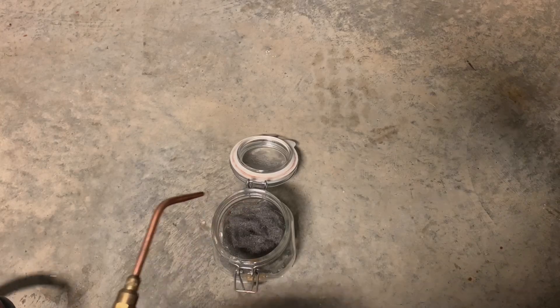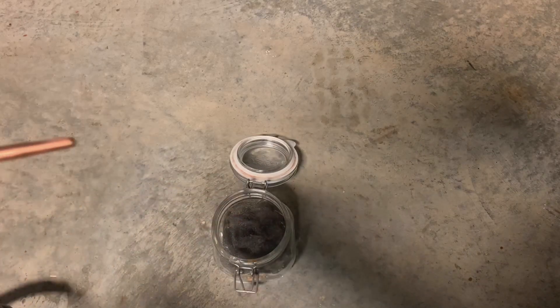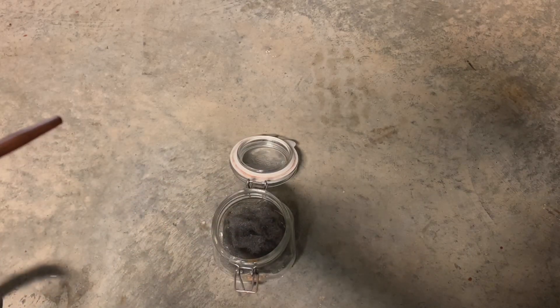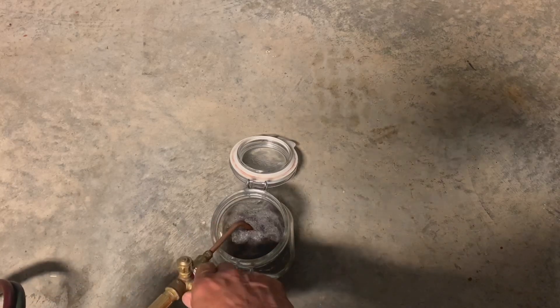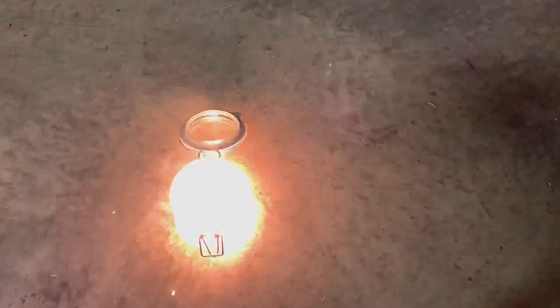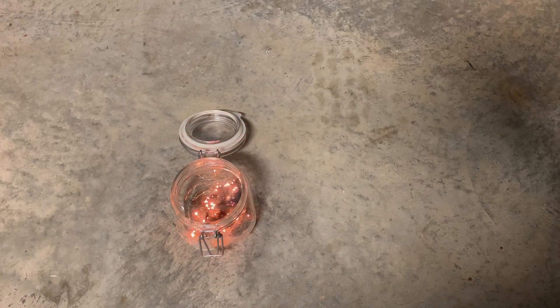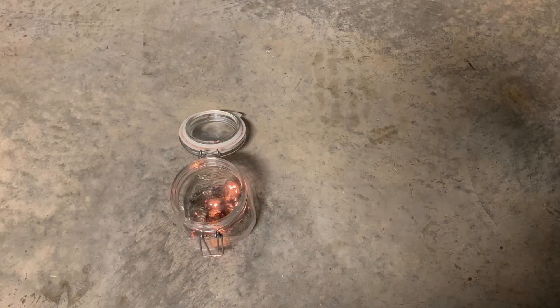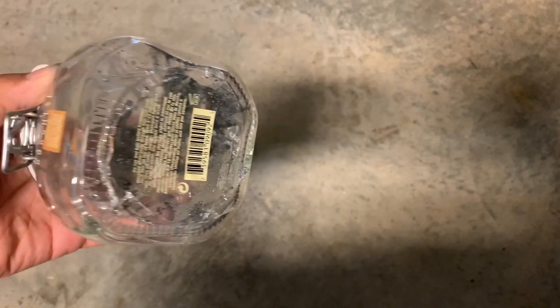For the last part of this experiment we're going to use pure oxygen from an oxyacetylene torch. So let's add the oxygen. Whoa, that was intense and extremely hot. The heat was so intense it just broke the glass.